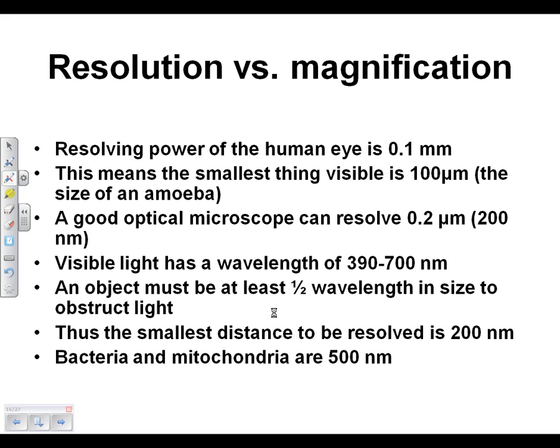So when you think about resolving power and magnification, the resolving power of a human eye is 0.1 millimeters.